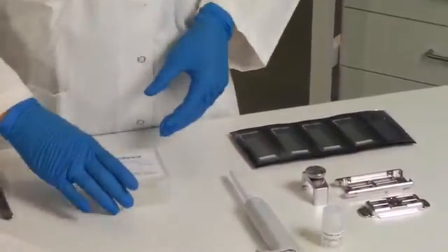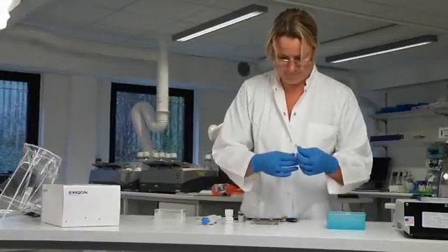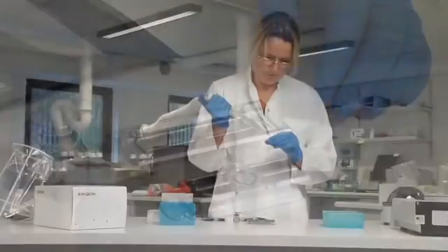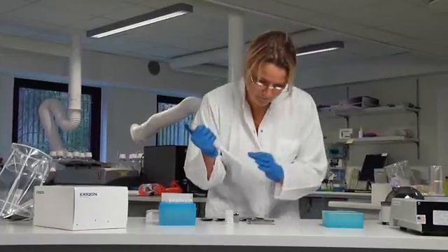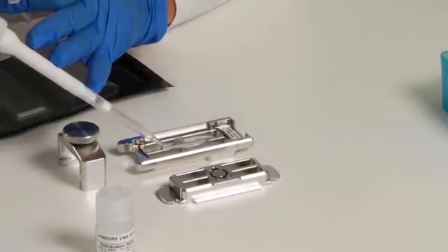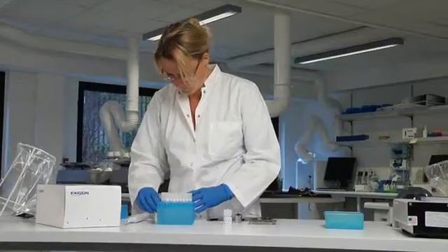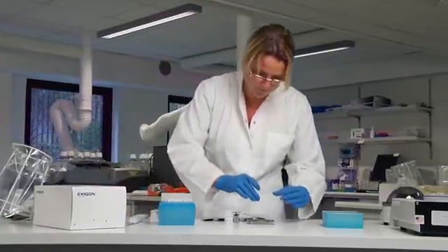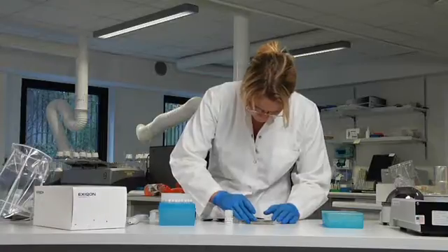Now it's time to assemble the hybridization chamber. First, place the backing slide in the lower part of the hybridization chamber. Ensure that the gasket faces upwards. Carefully load the sample and avoid creating bubbles. Then carefully place the microarray slide over the sample with the barcode facing down.